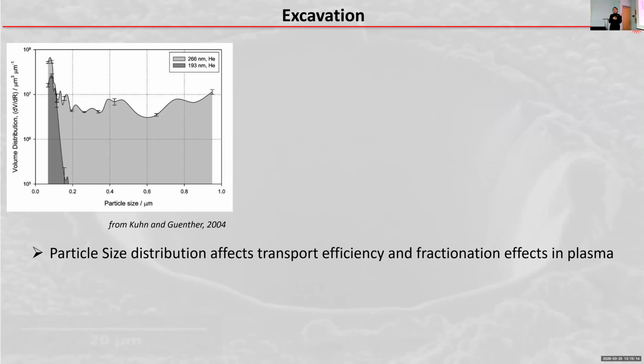And in this seminar, the title says laser ablation ICP-MS, but I'm not going to talk a lot about ICP-MS. It's a whole seminar of its own, and we're not going to open that up. But anyone who's a little bit familiar with ICP-MS will immediately see the analogy between particle size distribution and nebulization.